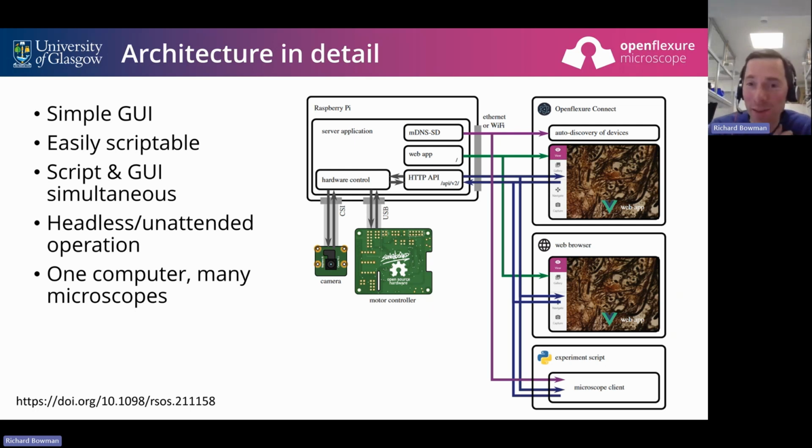You can imagine the level of frustration and tears in the coffee cup that this produces. Whereas if you've got all of the experimental control embedded in the instrument on a nice, simple, fairly minimal Linux distribution, then when your Windows laptop is forced to reboot, you don't kill the experiment.